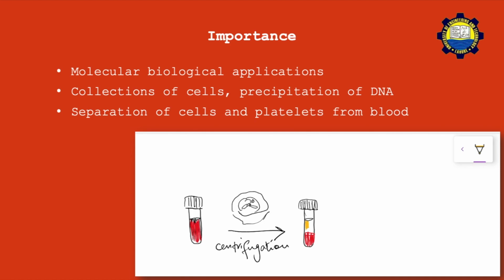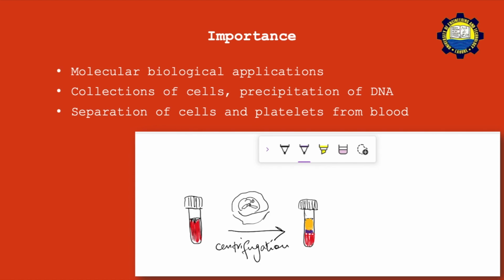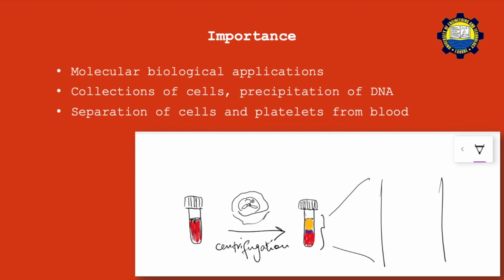through the centrifugation process. The centrifuge is going to contain the rotor and the mechanism to rotate these tubes at high speeds, and at the end of which, because different particles have different sizes and densities and viscosities, you see these different particles separated out at different positions in your container, in your vessel. Towards the very bottom you would see the red blood cells. Further up you are going to see some of the white blood cells, and then the platelets would appear on top. So the idea is that the denser the suspension, the further down the tube it appears.